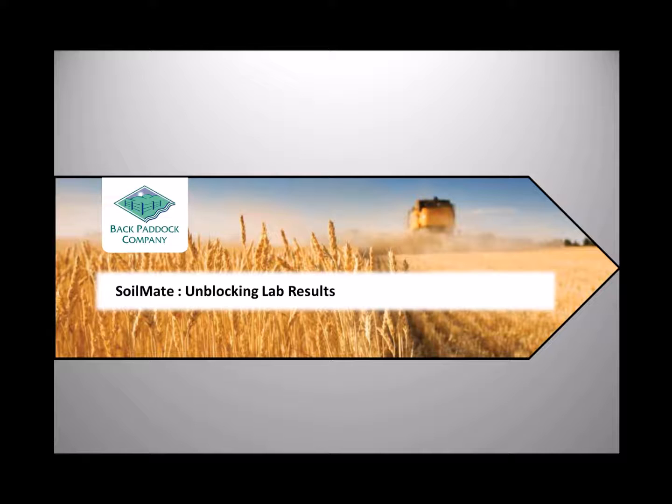In this video we'll be covering SoilMate and how to unblock a lab result that you have received. Now prior to this you would have received an email advising you that you had some barcodes on hold. Now we'll go through a couple of the reasons why that may be.